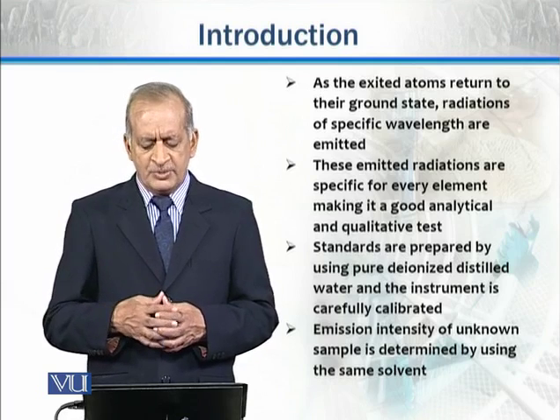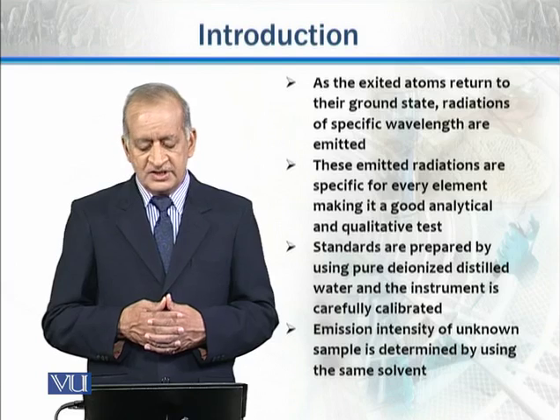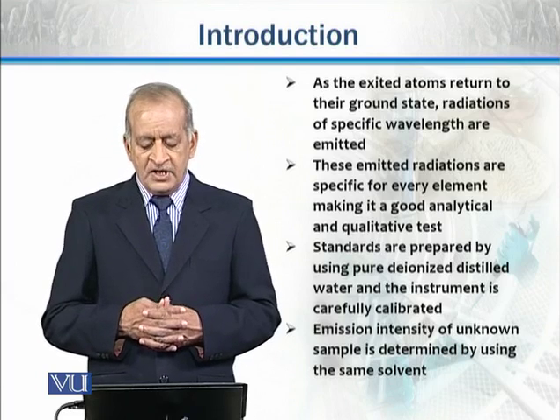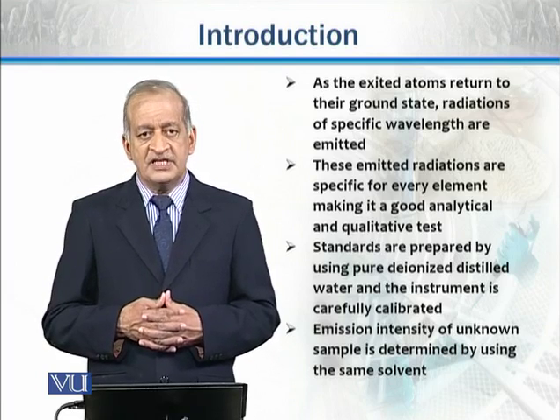So standards are prepared by using pure deionized distilled water, and the instrument is carefully calibrated. Emission intensity of the unknown sample is determined by using the same solvent.